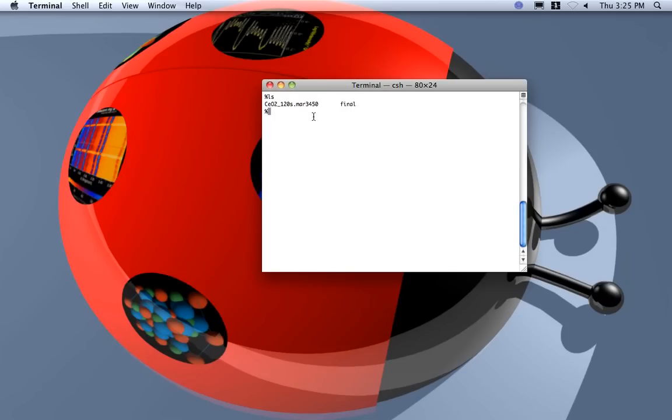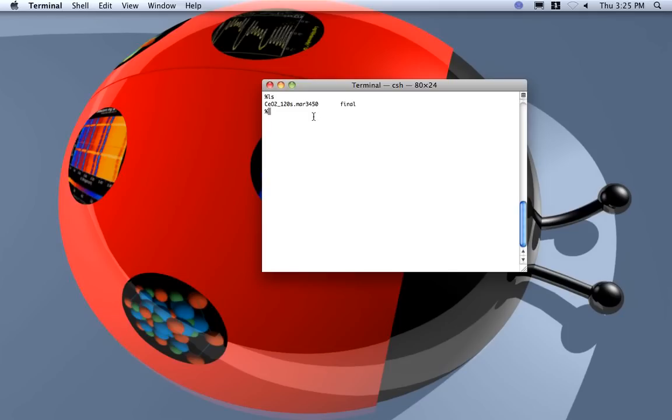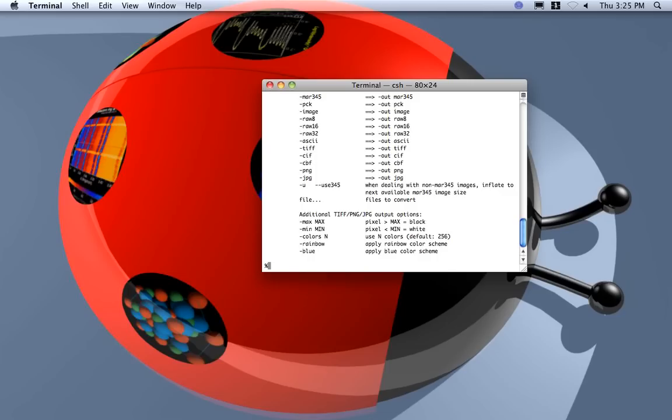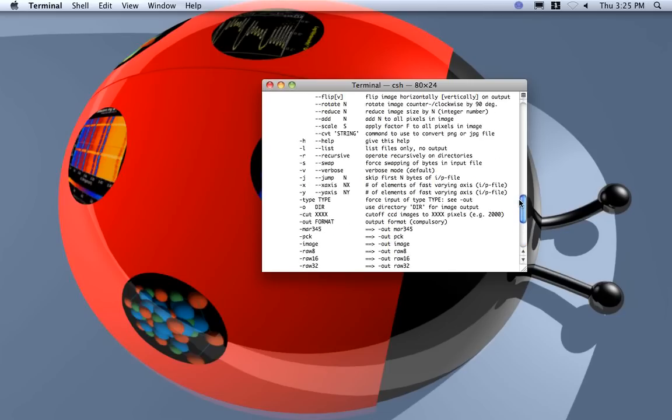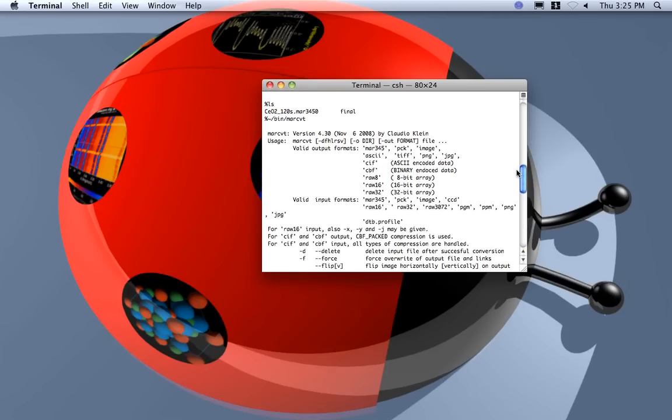To convert the image we can either use again fit2d to convert for example in tiff, or I will show you how to use instead the MAR research utility. You can download this utility on the MAR research web page. I have put them already in my bin directory.